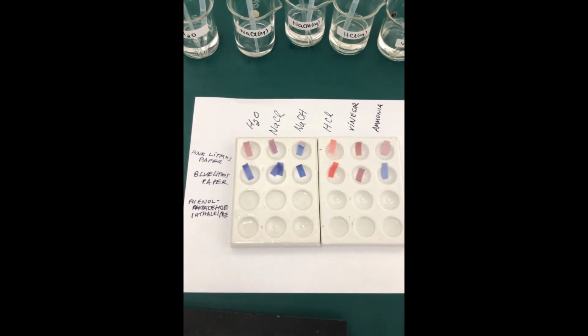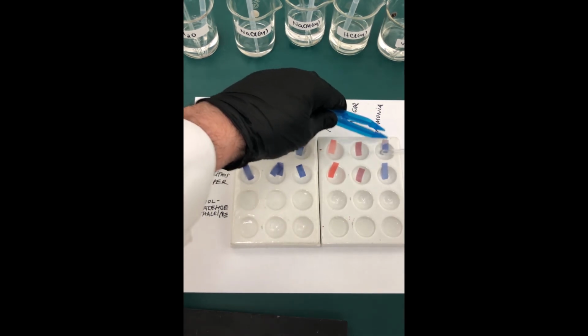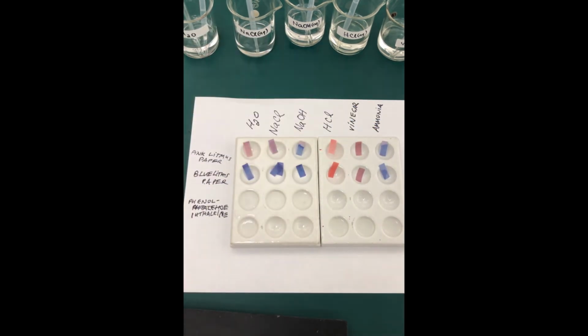Okay, the last one we're going to check is the ammonia. First against the pink litmus paper. As you can see, it turns it blue. Then against the blue litmus paper. And again, there's no change in there. So I'll have a picture of all of these posted in your PowerPoint or your video, whatever format we end up doing this in. So you'll be able to see a picture of all these together.